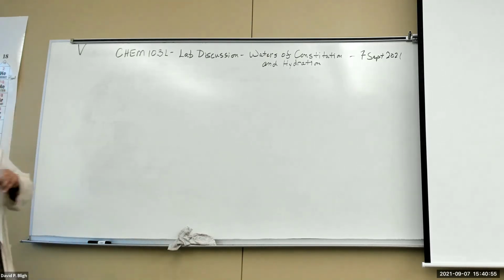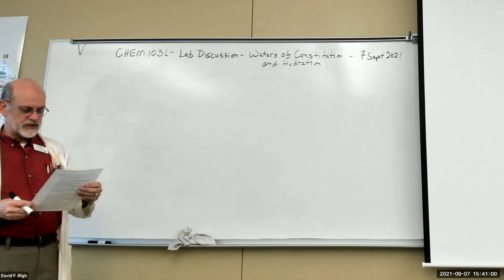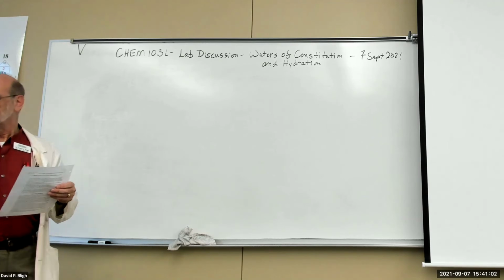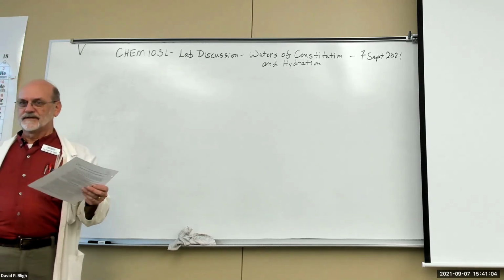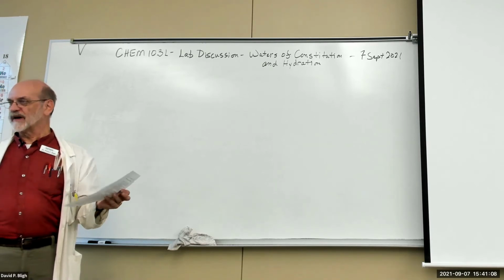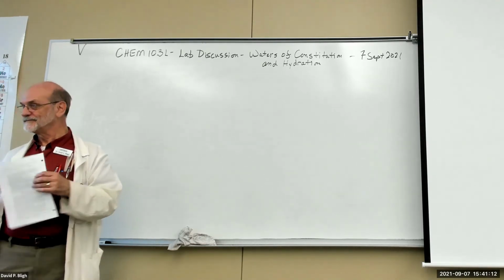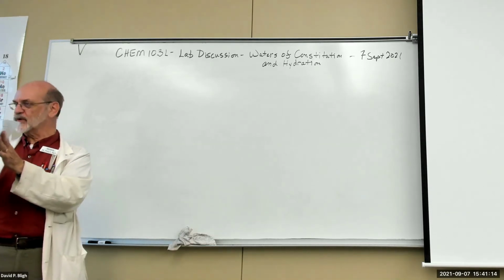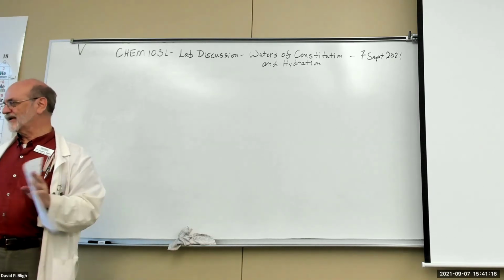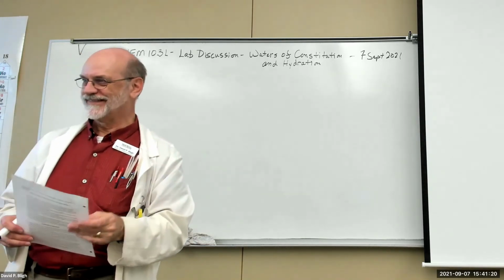Okay, pre-lab question. You're given a sample of gypsum. You know what that is? Wallboard. All modern homes are made with gypsum wallboard. That's what's in your walls. It's just sandwiched between two layers of paper. Like drywall? Yeah, drywall. That's gypsum.